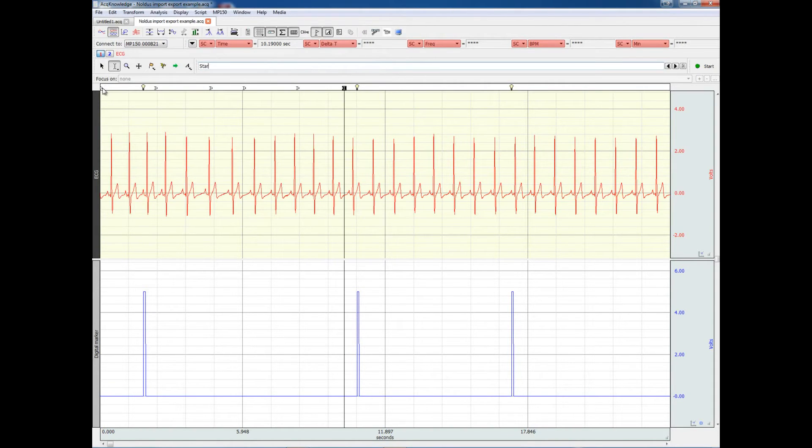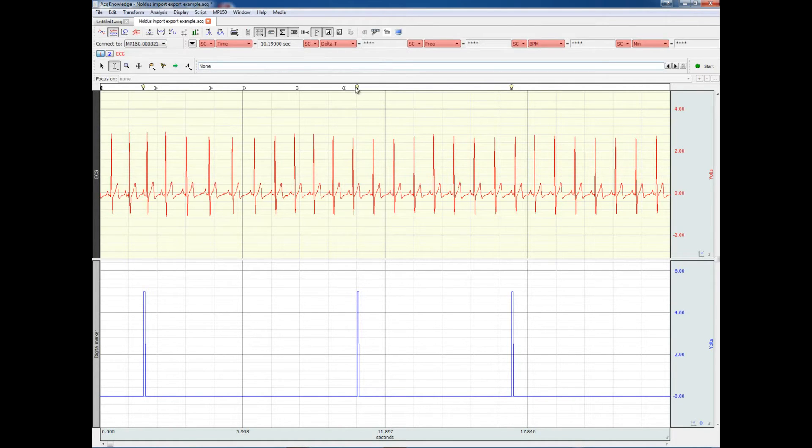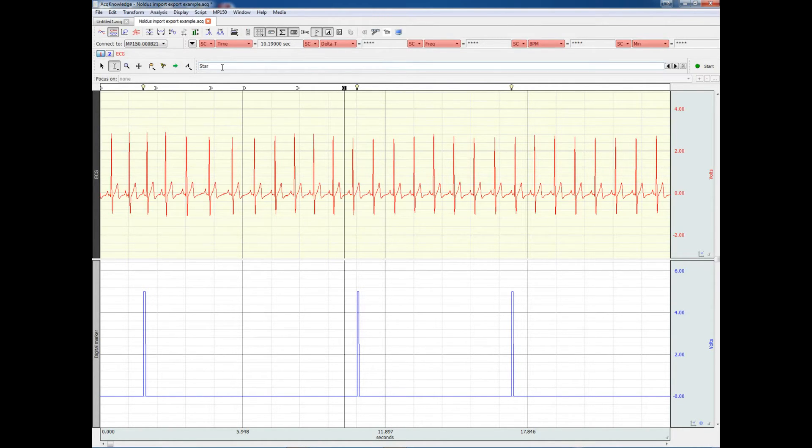Immediately, we can see the state BEGIN and END MARKERS are visible here together with the label.